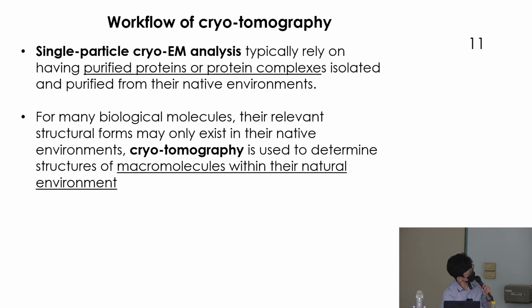So now we go to cryotomography, but go back one step before digging into it. We talk about cryo-EM. Currently, cryo-EM has two major types. Single particle cryo-EM analysis, you must have heard it a lot. This is the first type. And the second type is called cryotomography.